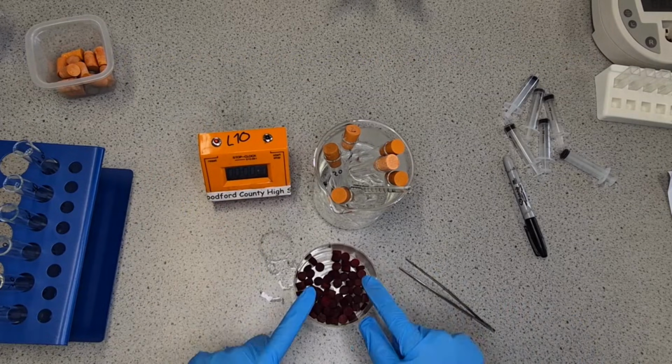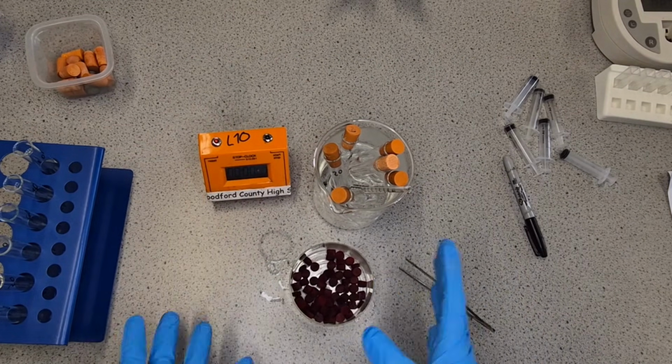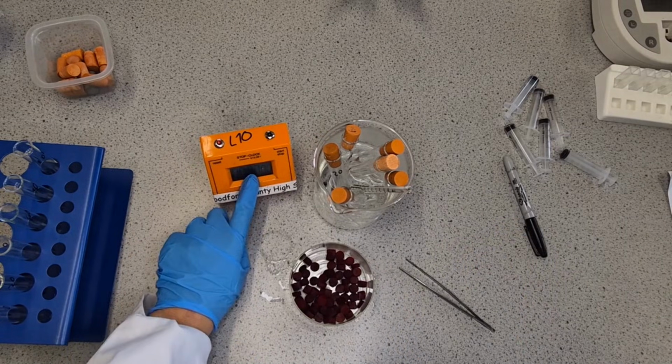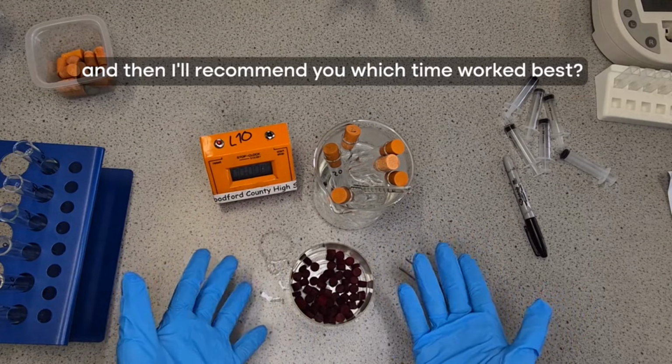So I'm now ready to put my beetroot discs in, start the stop clock and leave them for about 10 minutes. I'm going to check at 5, have a look at the results, and if I think it needs longer, we'll go on to 10, and then I'll recommend to you which time worked best.